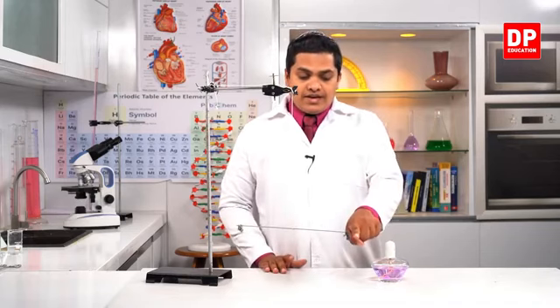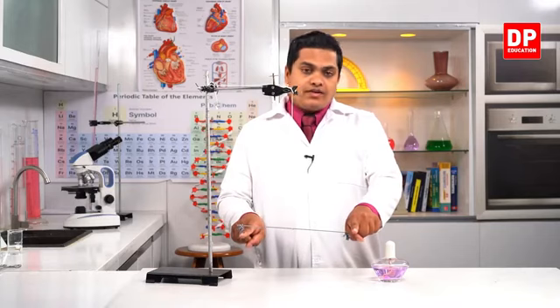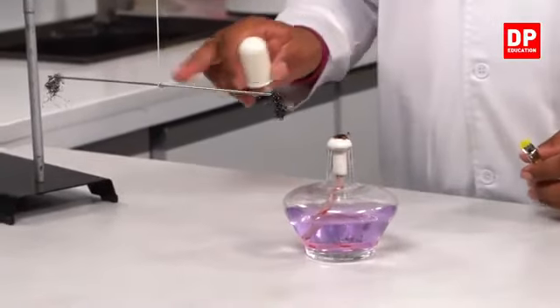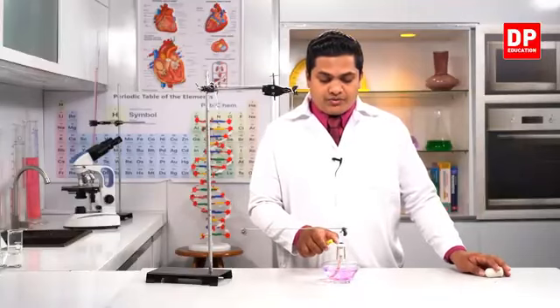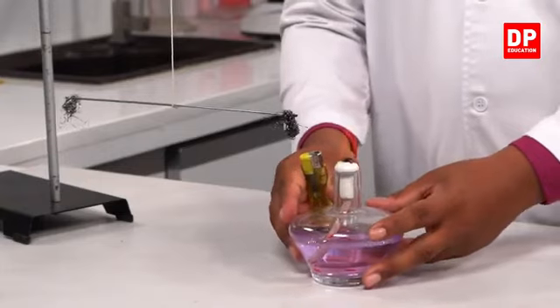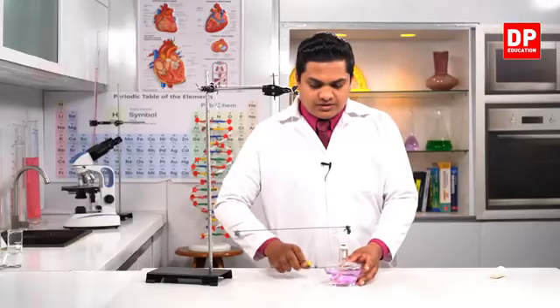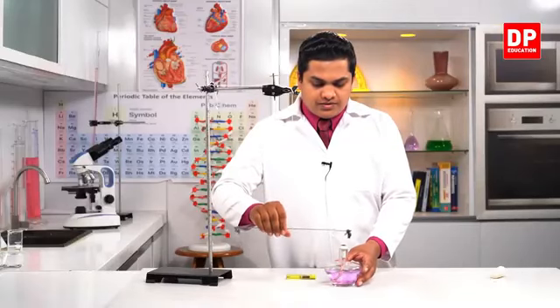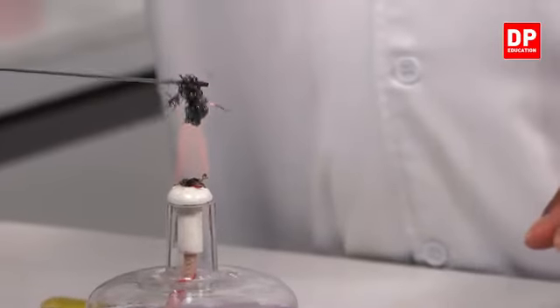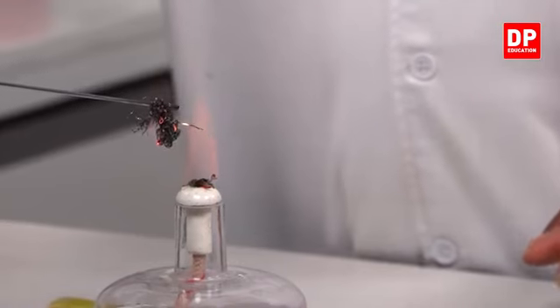Means that we can say the mass of this end is equal to the mass of the other end. That's why it is kept in a balanced situation like this. So now I'm going to heat this up. I'll hold the string and heat this up somewhat.